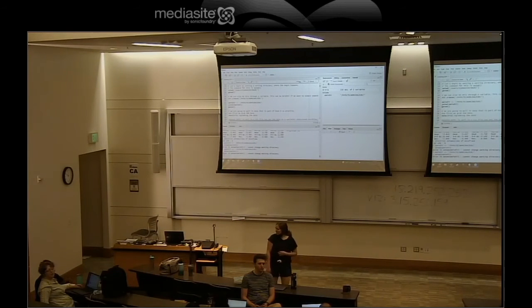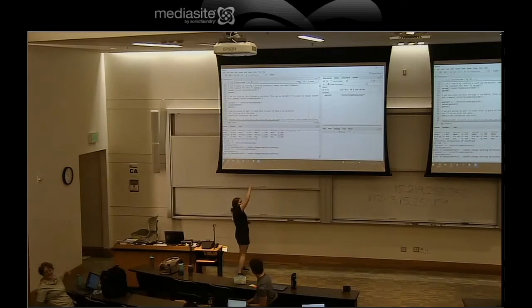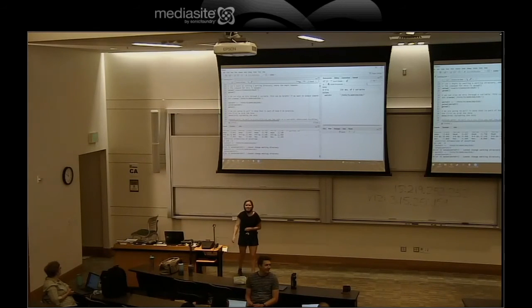I'm going to point out that the computer's talking to you when you run text. Don't ignore it. The console here is your output. It tells you everything you're doing and if it's working or not.